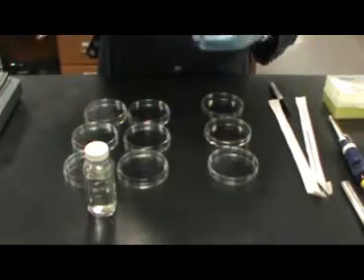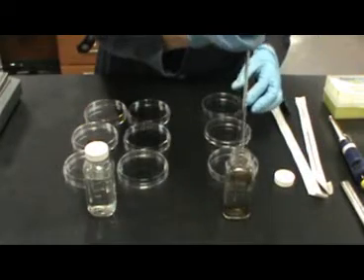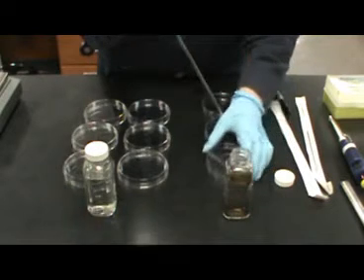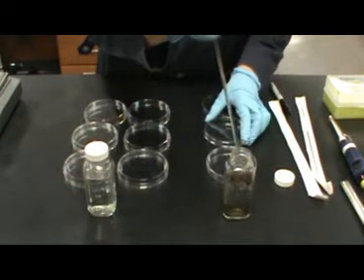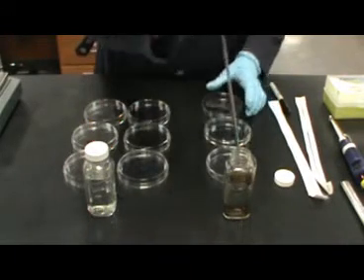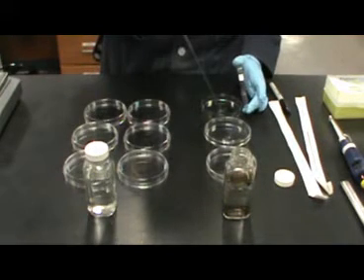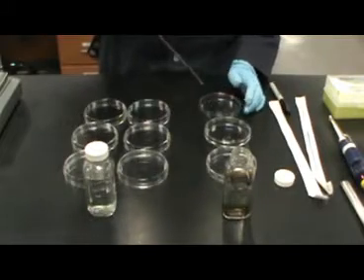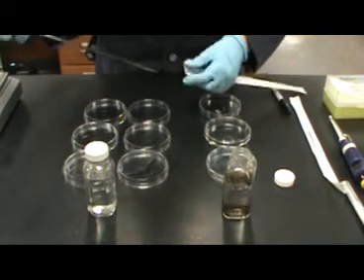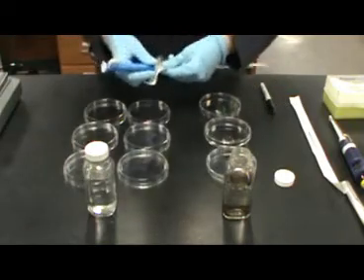From your 10 to the negative 2 dilution, you will remove 1 milliliter of sample. Using the serological pipette, remove the 1 ml and place the sample in the center of the empty plate. Be sure when putting your sample in the plate that each plate is labeled 10 to the negative 2 and that you are obtaining your sample from the 10 to the negative 2 dilution. When you have completed this for this first set of plates, you need to change the serological pipette. Place the used pipette back in its sleeve and carefully remove the pump.